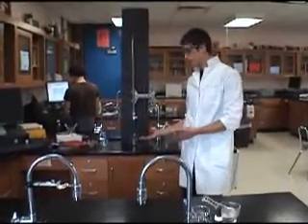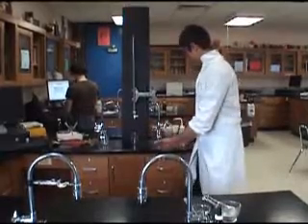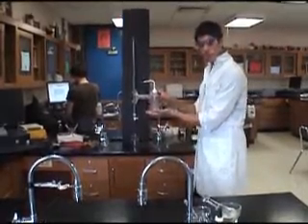Welcome to the world of titration. A typical titration setup consists of a burette, a burette stand, and a flask.